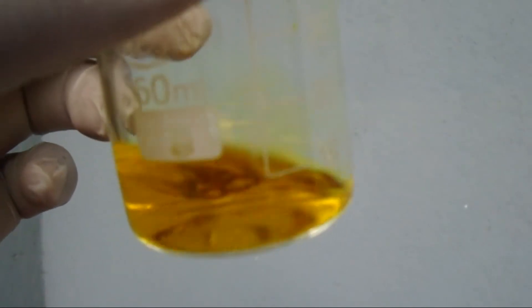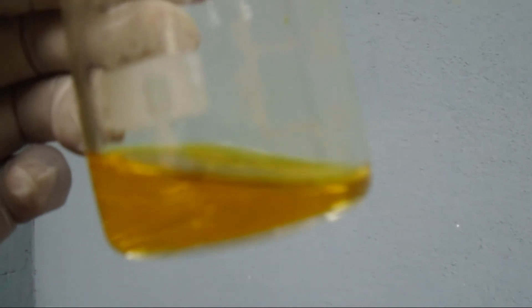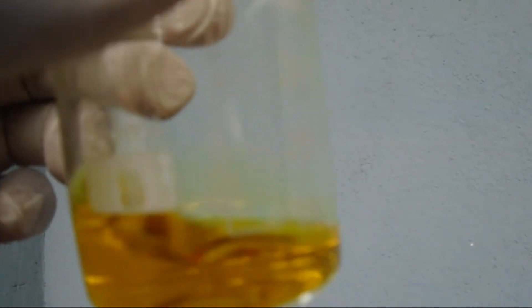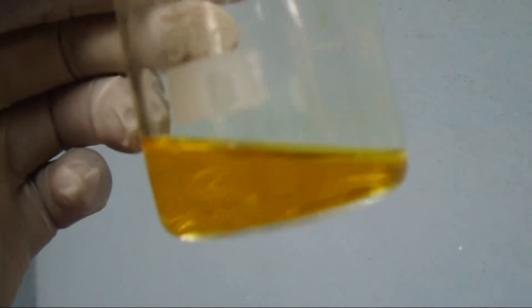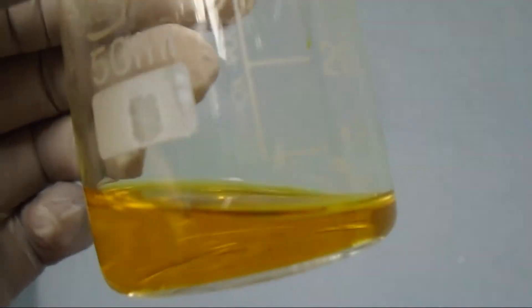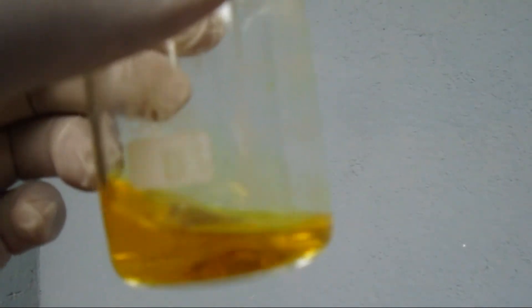I boiled the solution to remove the excess nitrogen dioxide and chlorine gas from the solution. Now this is a gold solution — we call it chloro-auric acid. If you want to get chloro-auric acid crystals, you crystallize this solution. We can use this solution to do a lot of experiments.